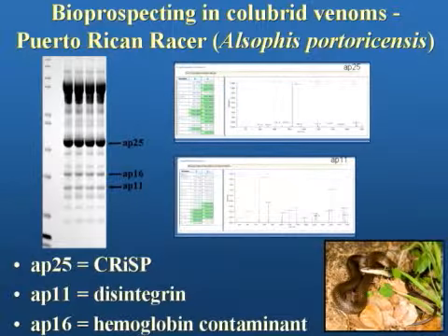We've been doing some work with this little snake here. It's called a Puerto Rican Racer. It's one of these rear fang snakes that a colleague sent to us. He's working on one of these Caribbean islands. Unfortunately, we haven't had the chance to go down there. I really would think that we need to get out in the field just because it might be a good thing. Anyhow, we've again done this same kind of separation of the venom, to get at this molecular fingerprint.